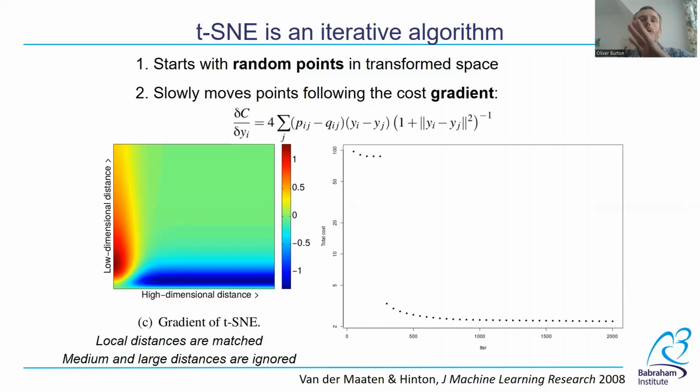Why do we need to use cross-entropy? Why can't we just use the original data or the tSNE coordinates? Well, remember that tSNE distorts the data, emphasizing differences while preserving similarity. So statistical testing on the original probability space has little power because it hasn't been grouped. And testing on the tSNE space is not correct. It's too likely to lead to low p-values, again, because it's emphasized those differences.